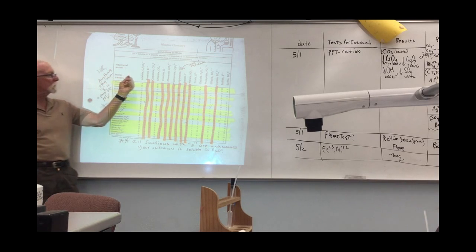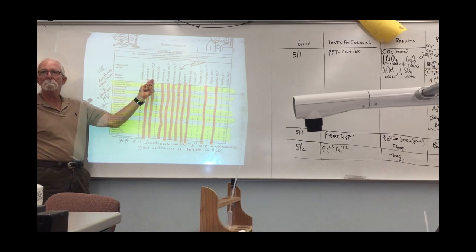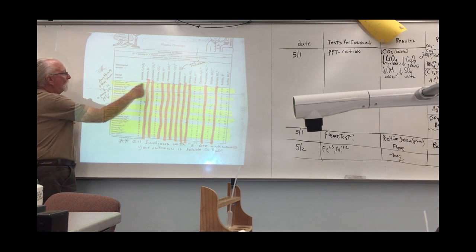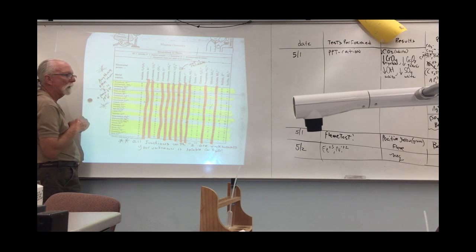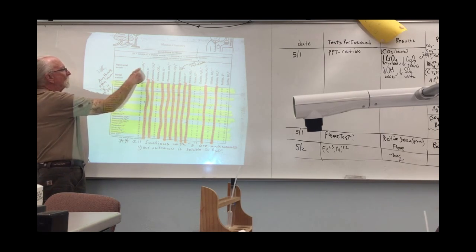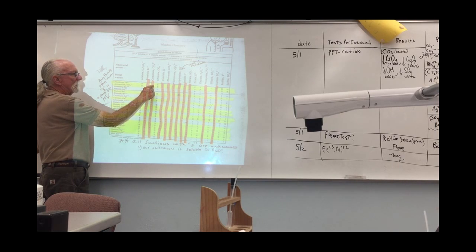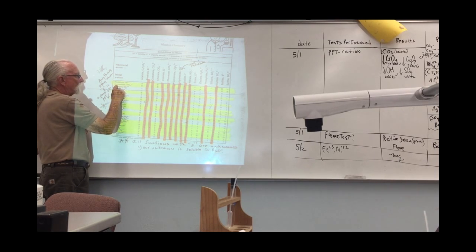We look across this to carbonate. And we go down this way and we look over at the things that we highlighted in yellow. Is it possible for my unknown to be aluminum? No. Is that an S? Is that an S? Then it's possible. Is it possible for my unknown to be ammonium?